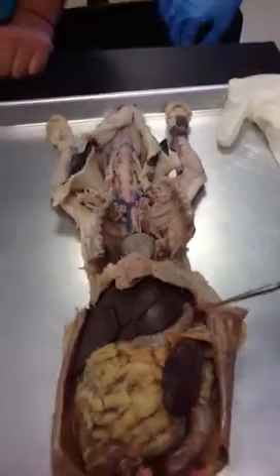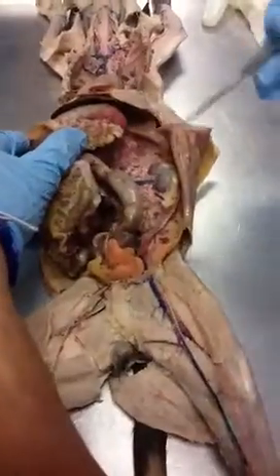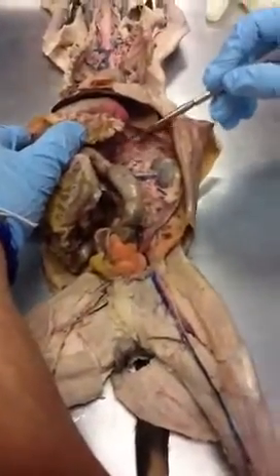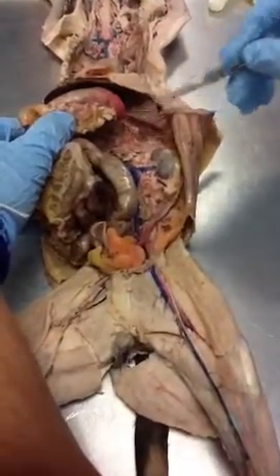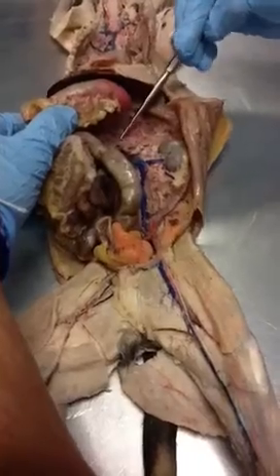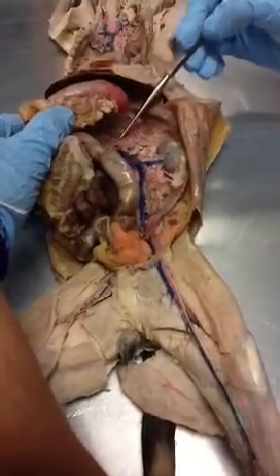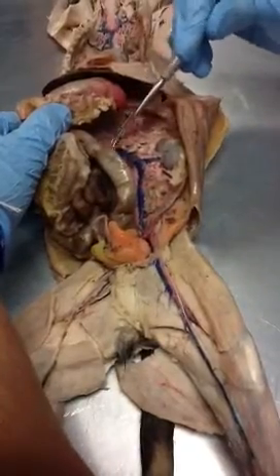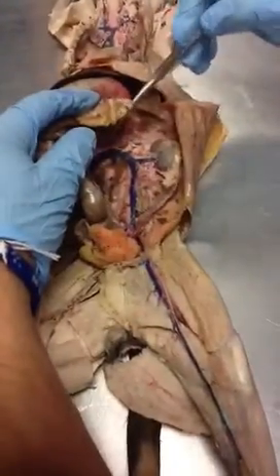Okay, underneath, in the abdominal section, you kind of have to go below the diaphragm, starting with the arteries. This is your descending aorta right here. This big thick one you can see. There's some fat, some tissue we've got to get rid of. This first division of the aorta, this is your celiac trunk. After your celiac trunk, this would be your superior mesenteric. And that makes sense because this is your mesenteric organ on top. So, superior mesenteric on top.